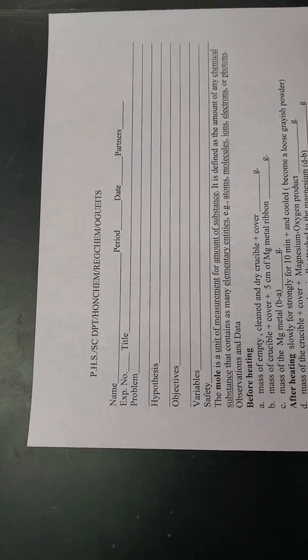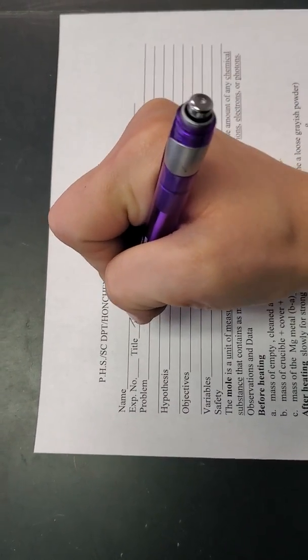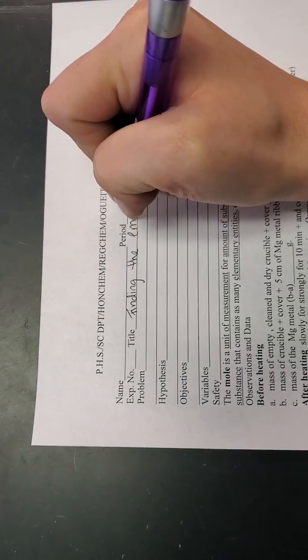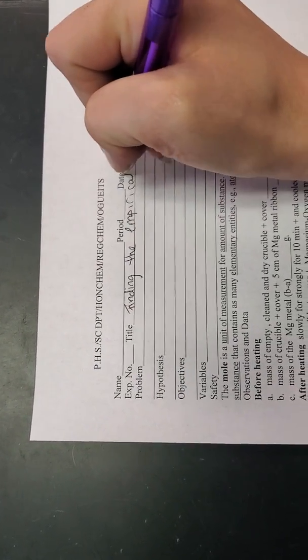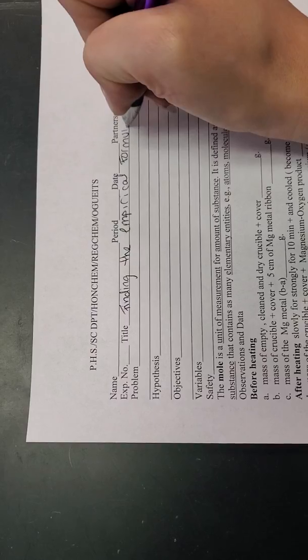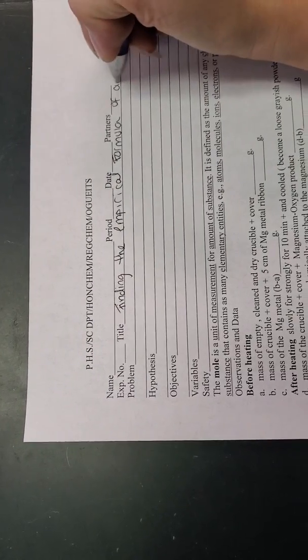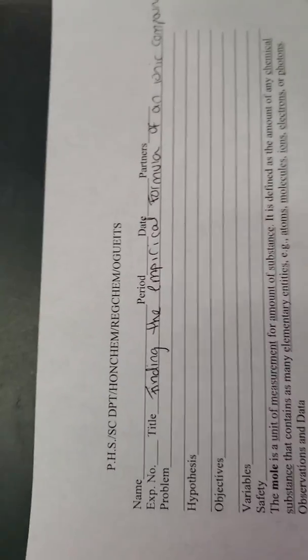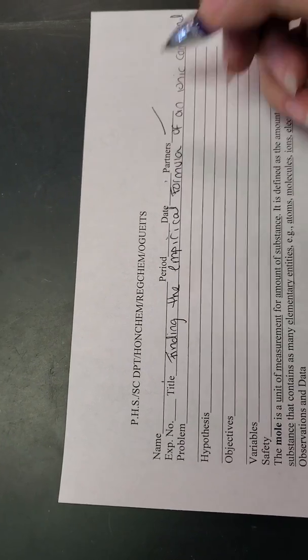So for this lab, the title of the experiment is going to be finding the empirical formula of an ionic compound. Okay. You need to put your name, the period, the date. Don't worry about partners. Don't worry about the experiment number.